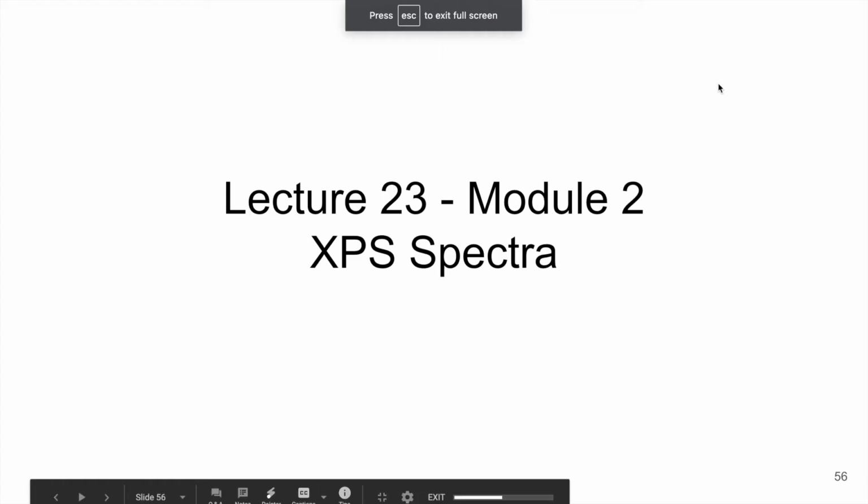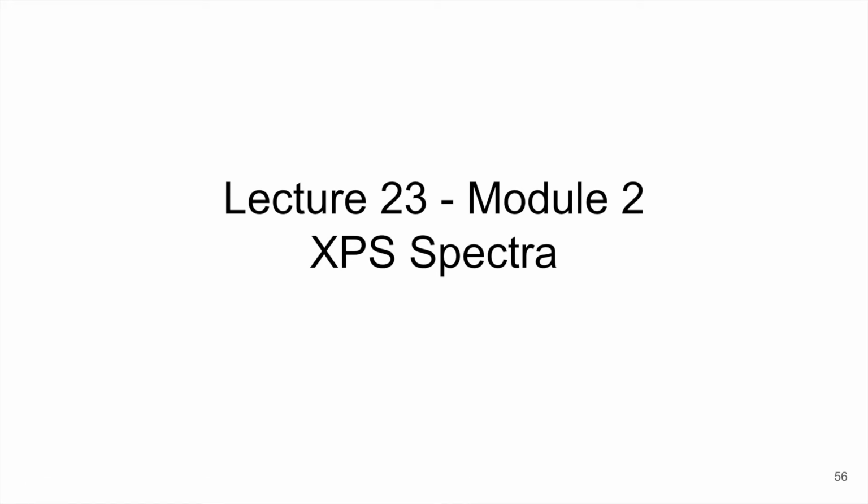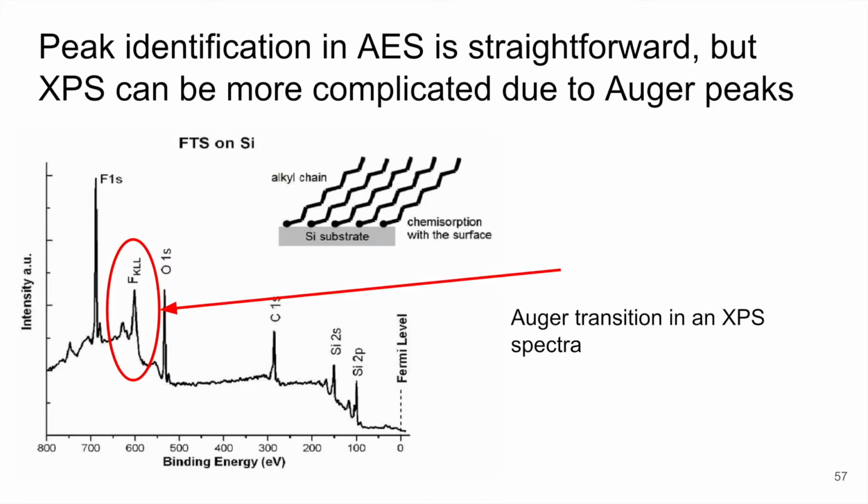All right, so let's now take a deeper dive at XPS spectra. So what it looks like, what information we get, and some of the features that we tend to see. So we're going to take a deep dive on the spectra.